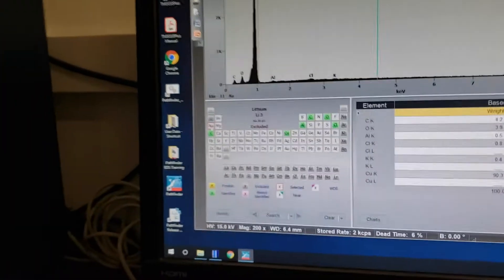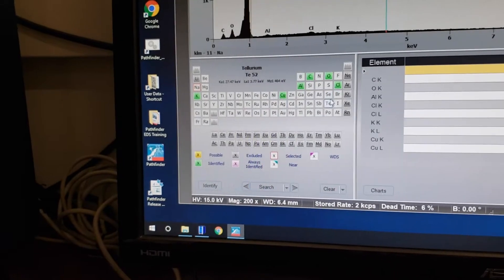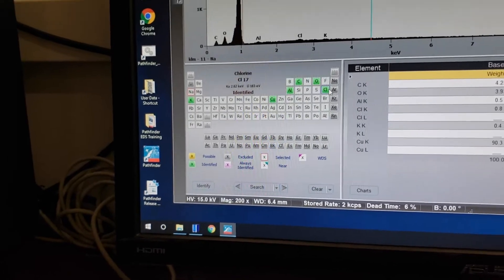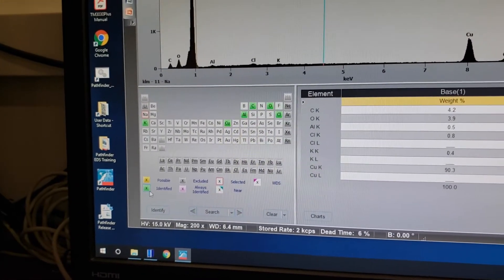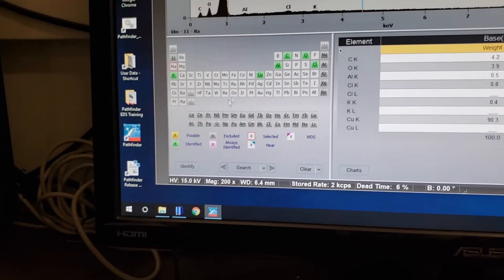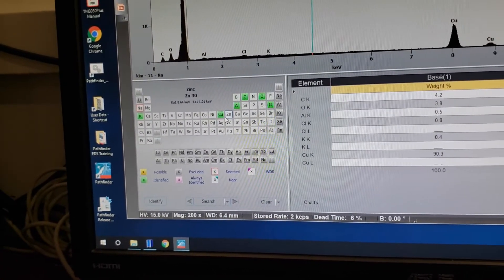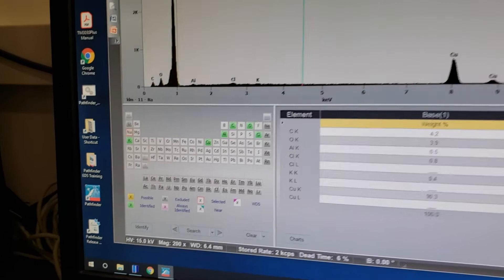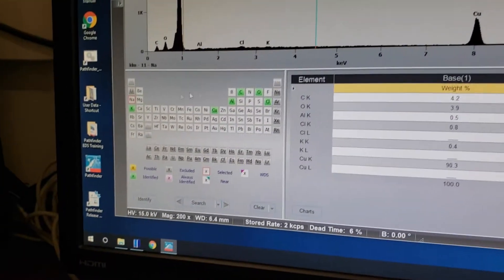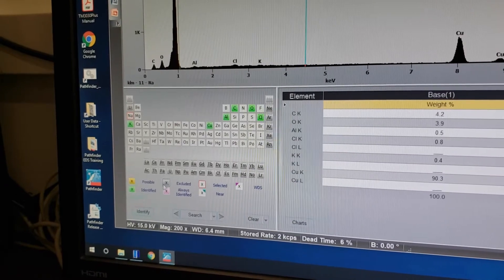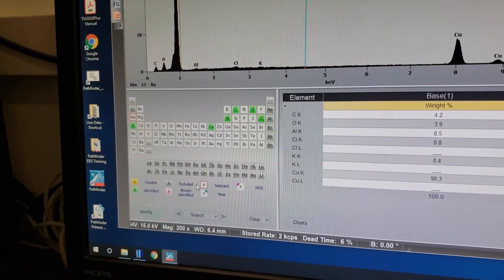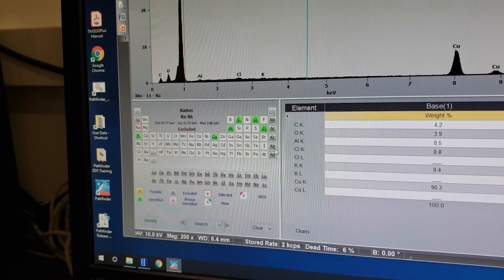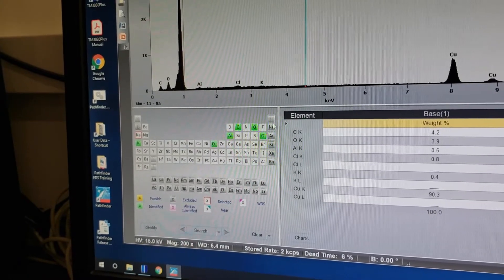Down in the corner we have our periodic table. Anything labeled green is what the software has identified. Yellow means the computer thinks an element is possibly there but was not able to verify it — you won't see it on the graph but will see it in yellow in the corner. Darker gray means 'excluded' — the software is not even looking for those elements, such as noble gases.